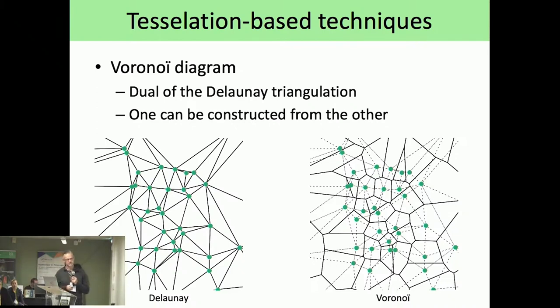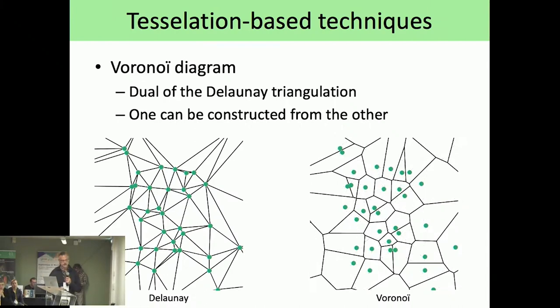These are bisectors from the connection here, so it defines polygons. In this case, it's easier because you have one polygon per molecule, which is of course defined from the neighborhood. And then with that, you can very easily define one parameter, which is the density.